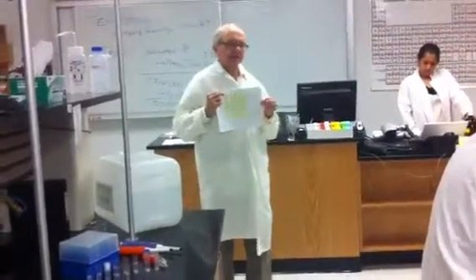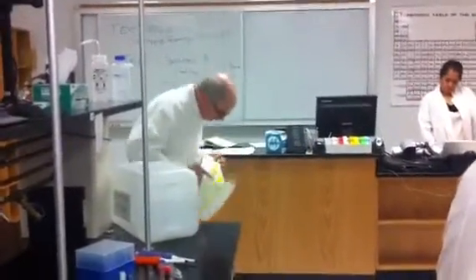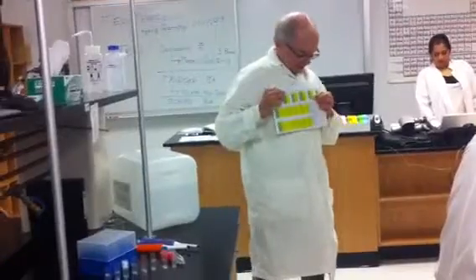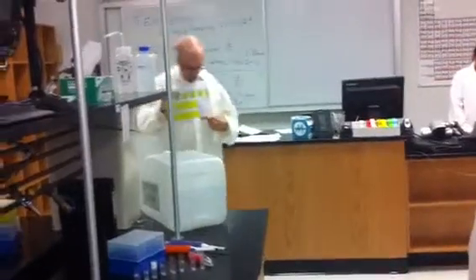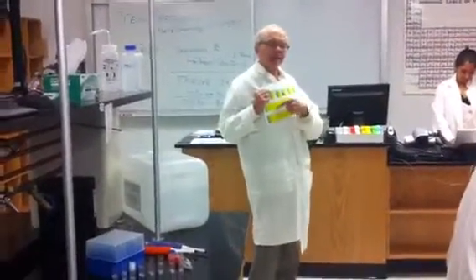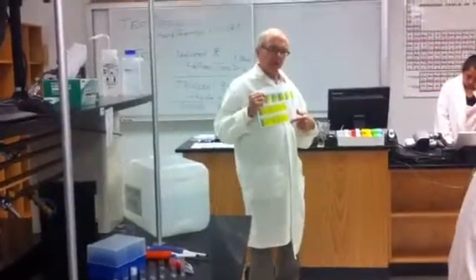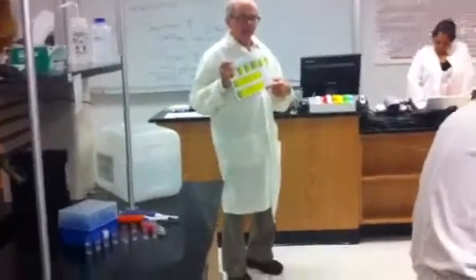And then it gets complicated because from there you have to then construct curves based upon this. These are smart cells over here. Rajiv, these are smart cells over here. In other words, these cells are watching what you're putting in here. They will change and update as you put in your data.